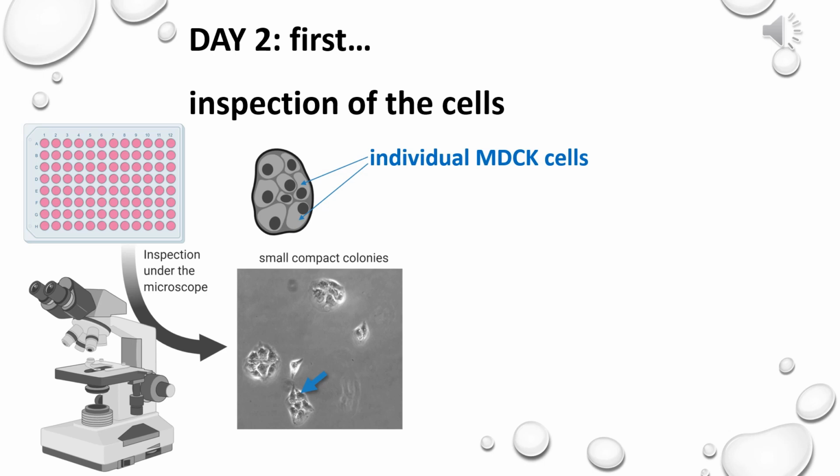What happened during the night? Did the cells grow? Did they form colonies? We don't need to do all 96 wells, that's rather boring, but you just need to get an impression of what happened there. Theoretically, they're all the same. Our biggest fear is that during the experimentation yesterday, during the preparation of the cell suspension, some uninvited guests arrived.